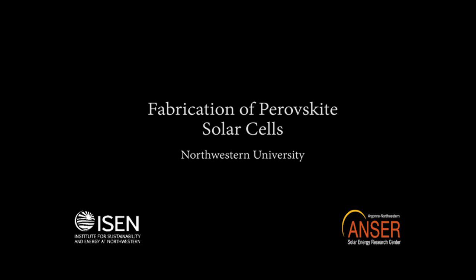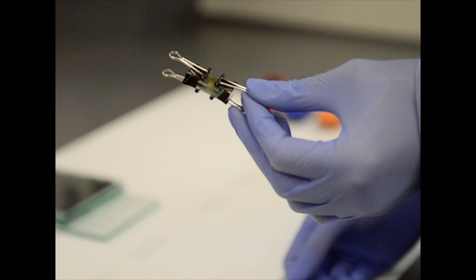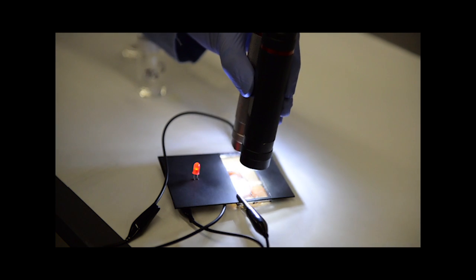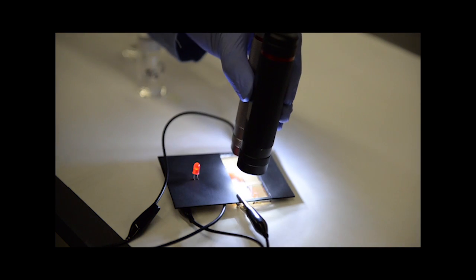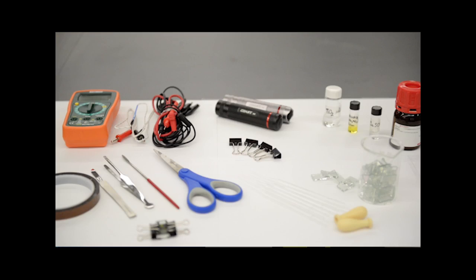In this video, we are going to fabricate perovskite solar cells. A solar cell is a device that converts sunlight into electricity. The cost of fabricating one cell is less than 50 cents. It only takes a few hours and we use standard laboratory equipment. This experiment is highly appropriate for general chemistry students to learn about this state of the art renewable energy technology.